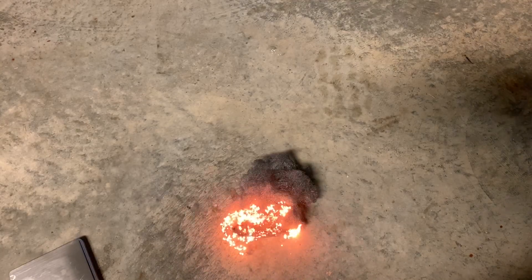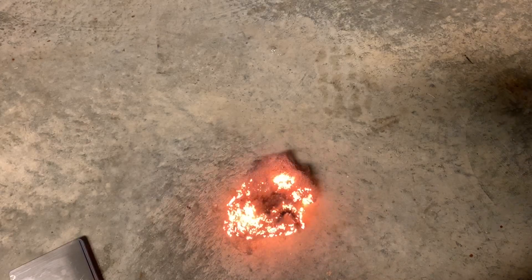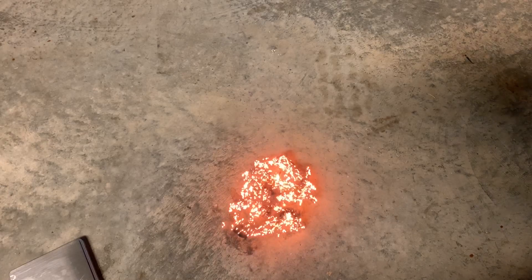So let's see what happens when we burn this. Remember it weighed 4.2 grams. And look at that — that's in just air. That huge surface area means it has much more access to the oxygen in the air, and it basically completely burns up.